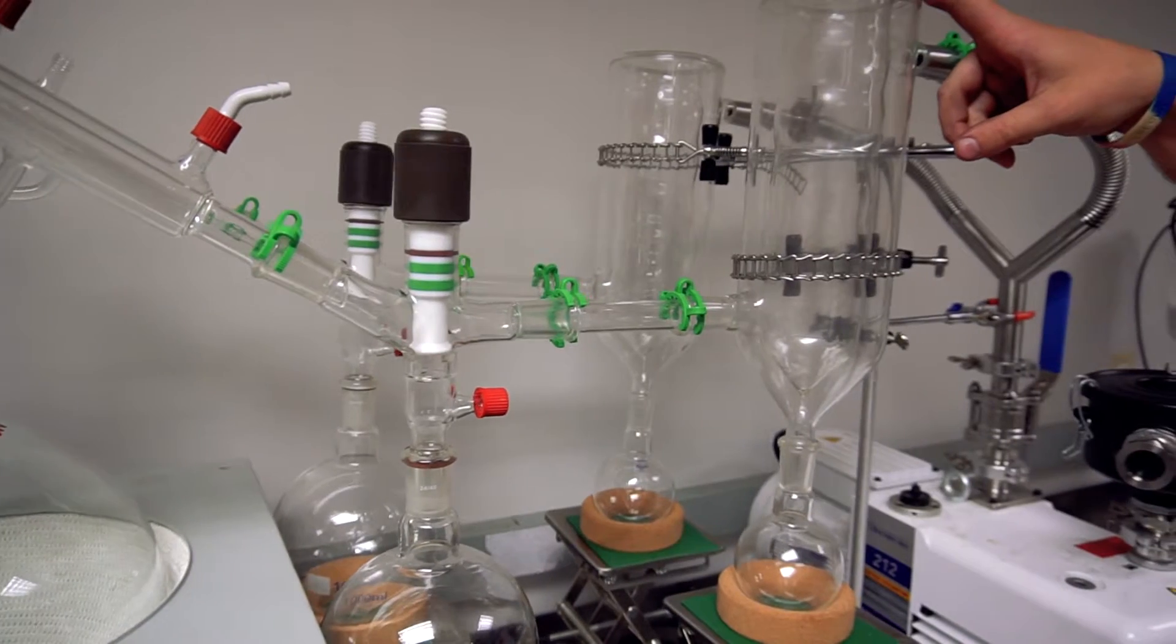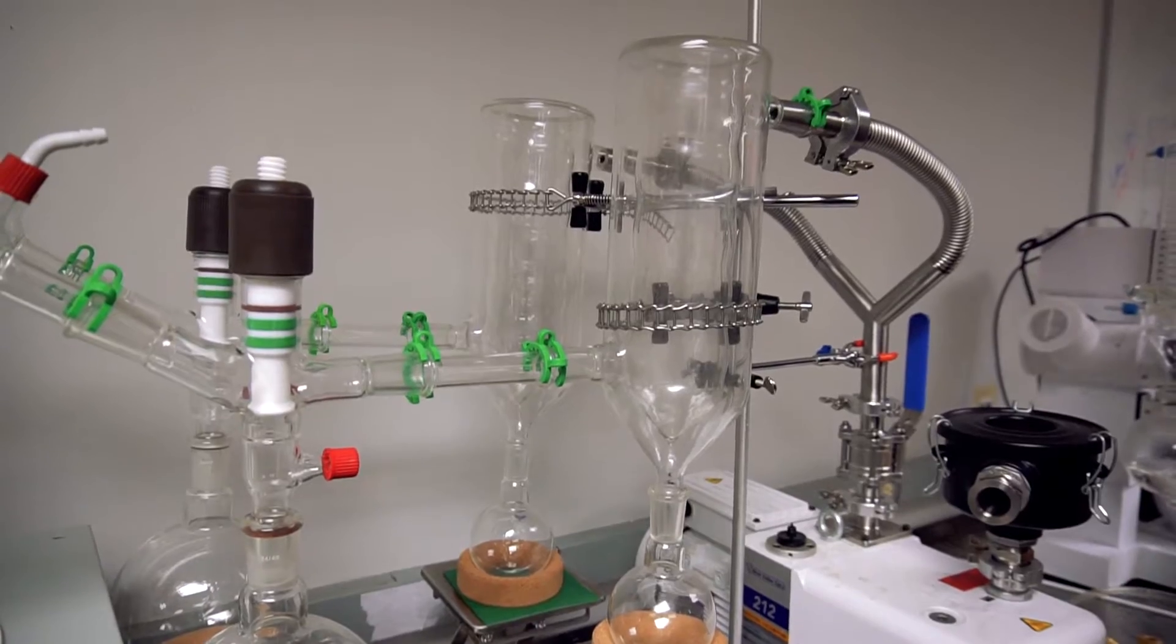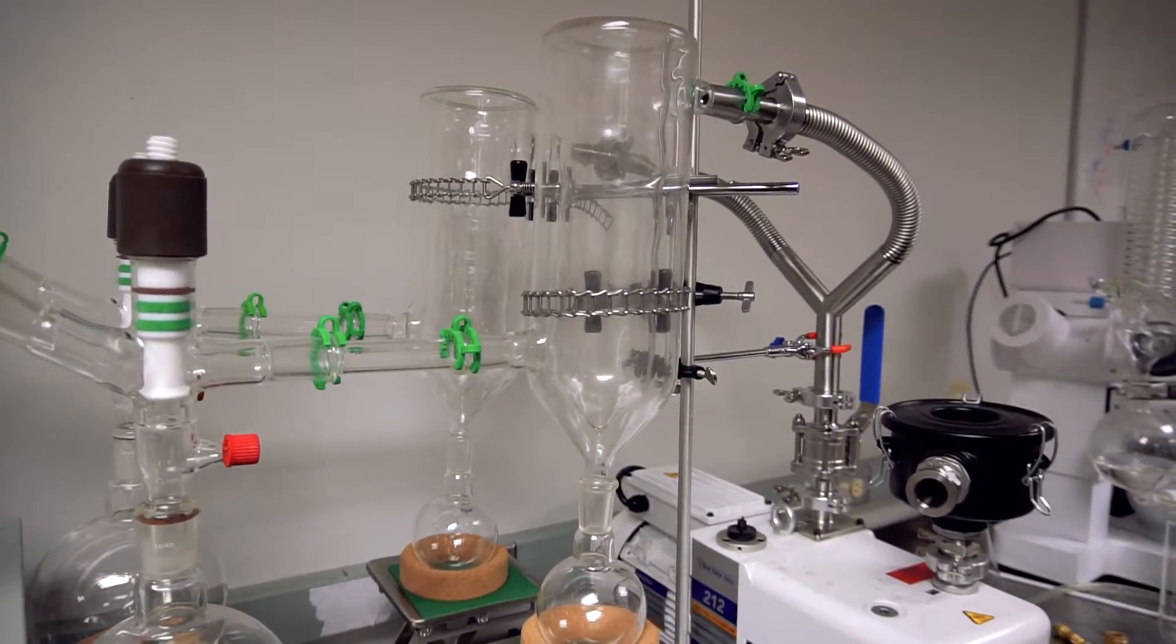Then it goes to our Dewar cold traps. They have ribs for extra surface area in the middle. That will help condense any vapors that make it past your condenser on the short path head.